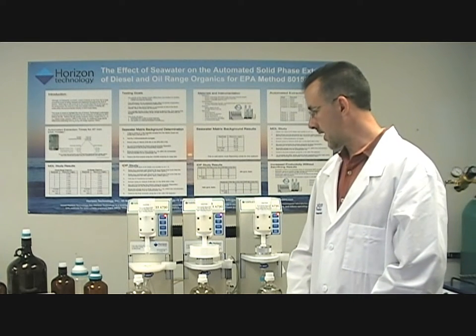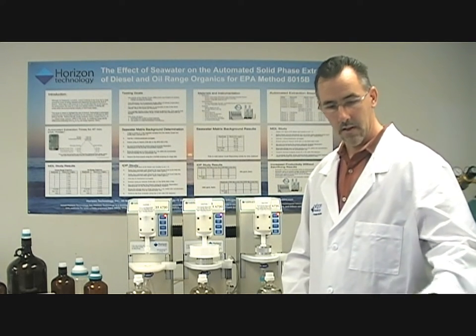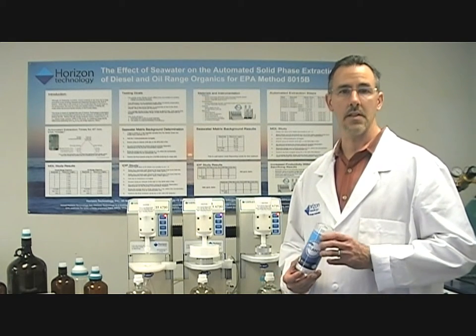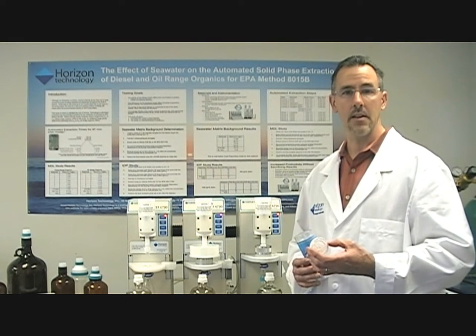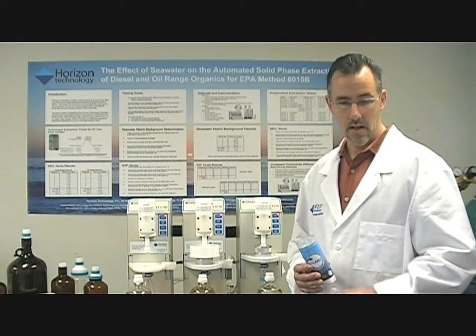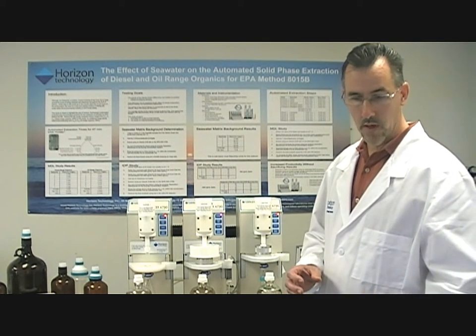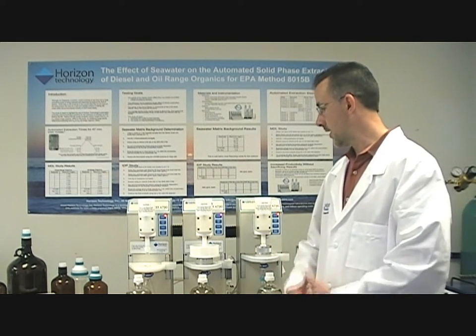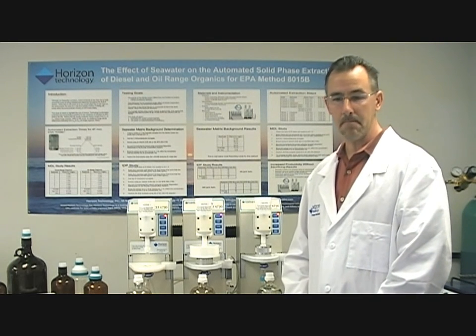What we have is a technique that involves solid phase extraction. We've recently launched a new solid phase extraction disk — it's a 47mm disk. We call it our Atlantic 8271 pass, and it enables the ability to extract over 200 semi-volatile organic compounds using a solid phase extraction technique.